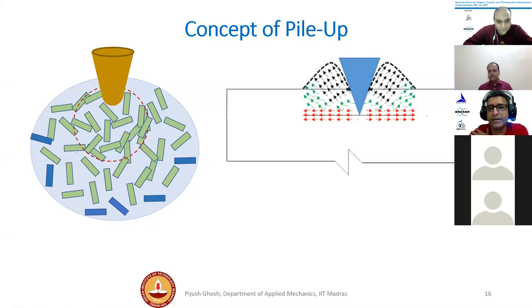Okay, Priya. Yeah, I think this is the last question. So then we'll move. So Priya Pandey wants to know: if you have a volatile solvate, how do you handle that? Does the displacement plot indicate any changes?